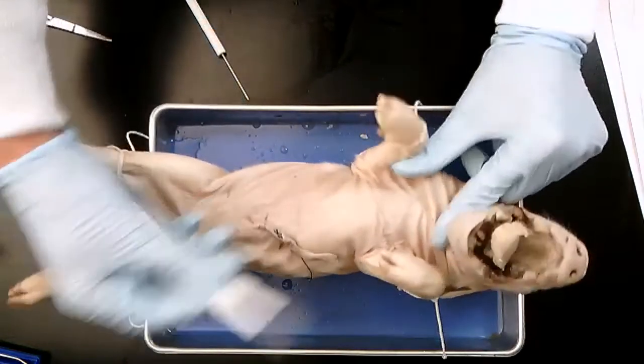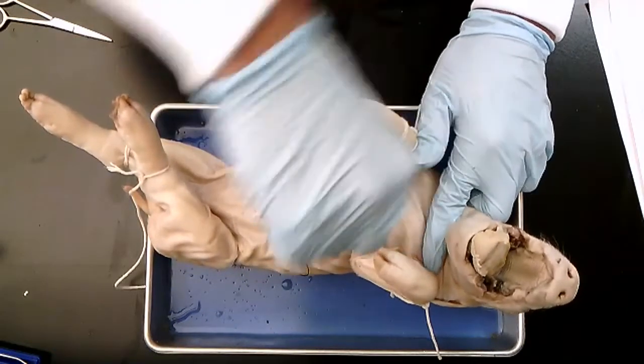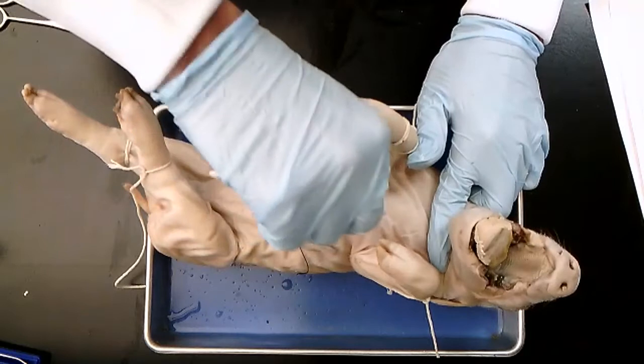So to start with, when you make your first incision, be very careful not to go too deep, because you're going to rupture the organs.